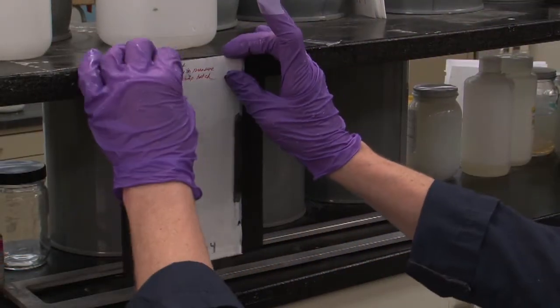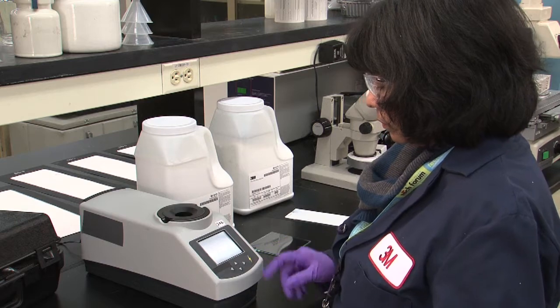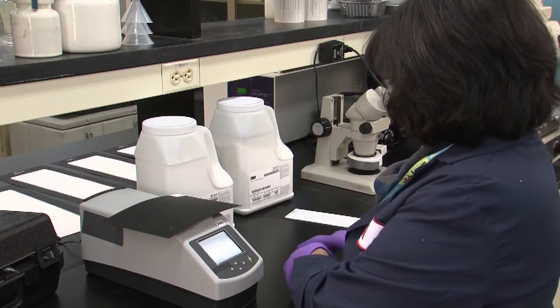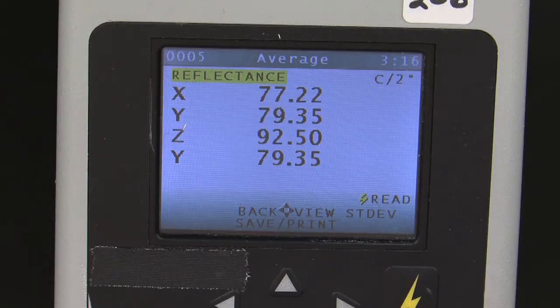The panel is then rinsed and left to dry for 24 hours. We then re-measure the reflectance to determine the recovery percentage in order to evaluate how the soiling and washing have affected the paint film's properties. The reflectance test can be seen in a separate video on the 3M Paints and Coatings website.